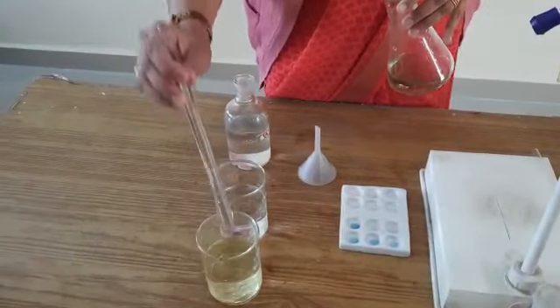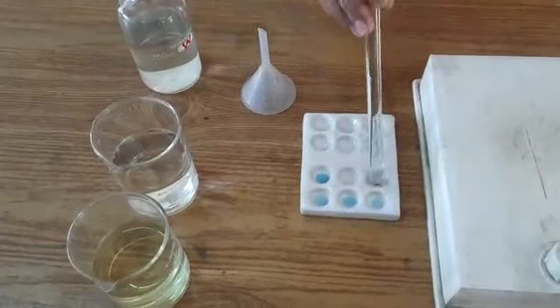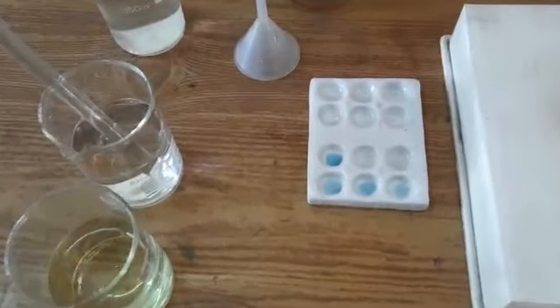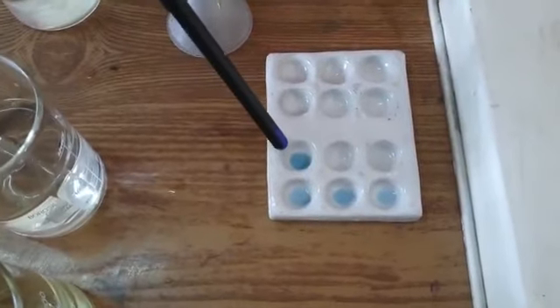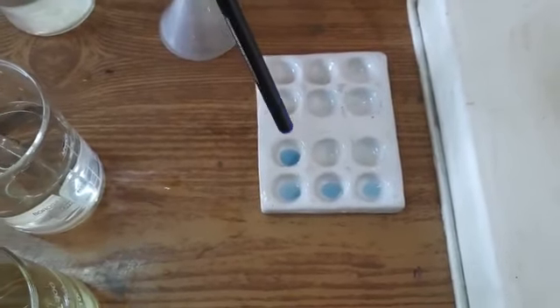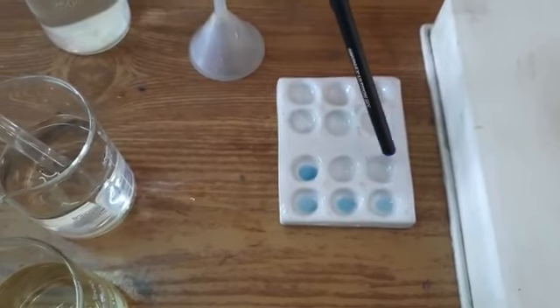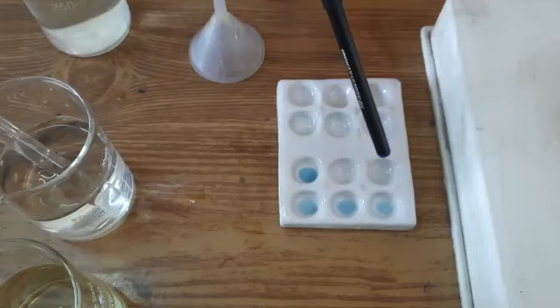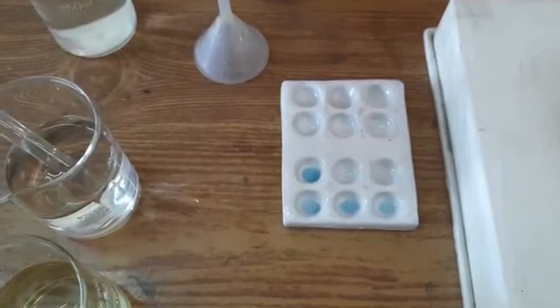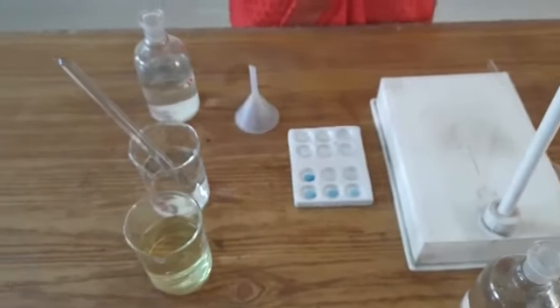Let us check whether we get a colorless solution now. Here you can see that initially we get different shades of blue, indicating ferrous is still present in the solution in the form of a complex. Now the colorless solution indicates that all ferrous ions have been converted into ferric ions and no further complex formation will take place. This is because this indicator also contains ferric ions — so with ferric ions on both sides, complex formation stops. This is the end point of this titration.